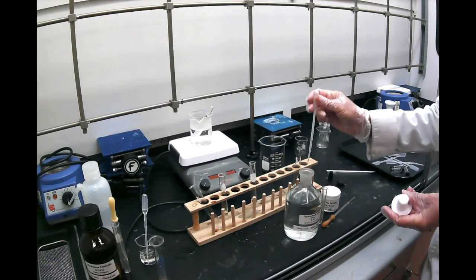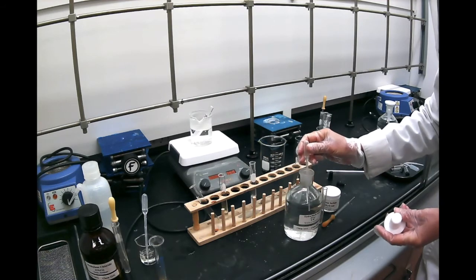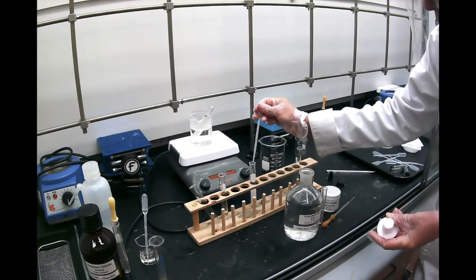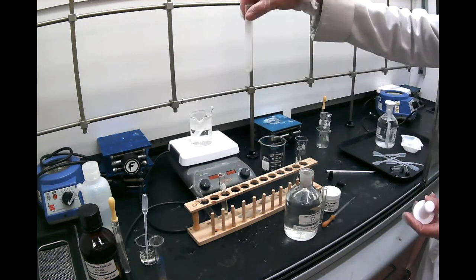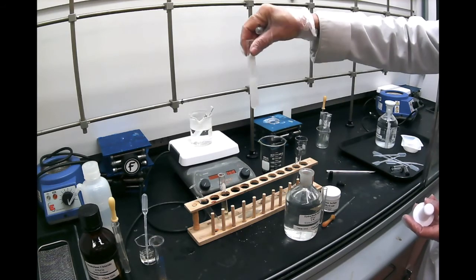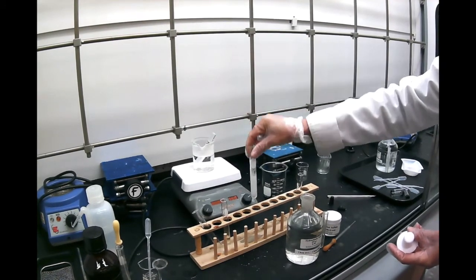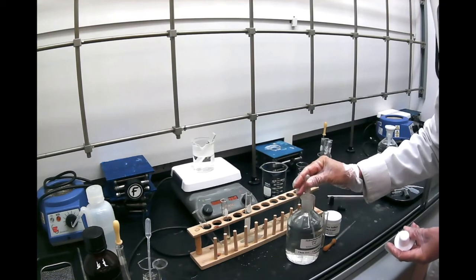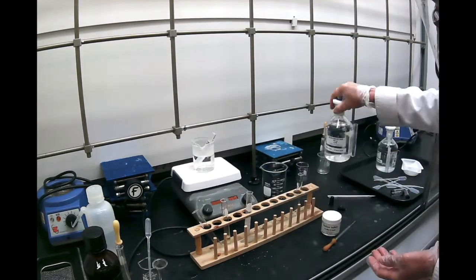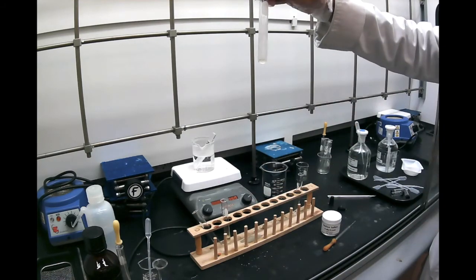So I'm adding here a few drops at a time, some hydrochloric acid. Of course, it's an exothermic reaction, but you see already that there is a white precipitate, and that's the benzoic acid that is being neutralized. The benzoate is turning back into benzoic acid. I can add a little bit more just to show you that we now have the benzoic acid in this test tube.